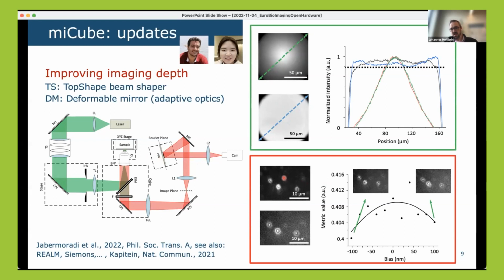So what you can see here is that this point spread function, in our defocus, always has a tilt in a certain direction. And by improving over all those modes, fitting that accordingly, you end up with what you would like, and that is, in most simple cases, very symmetric patterns of the point spread function.